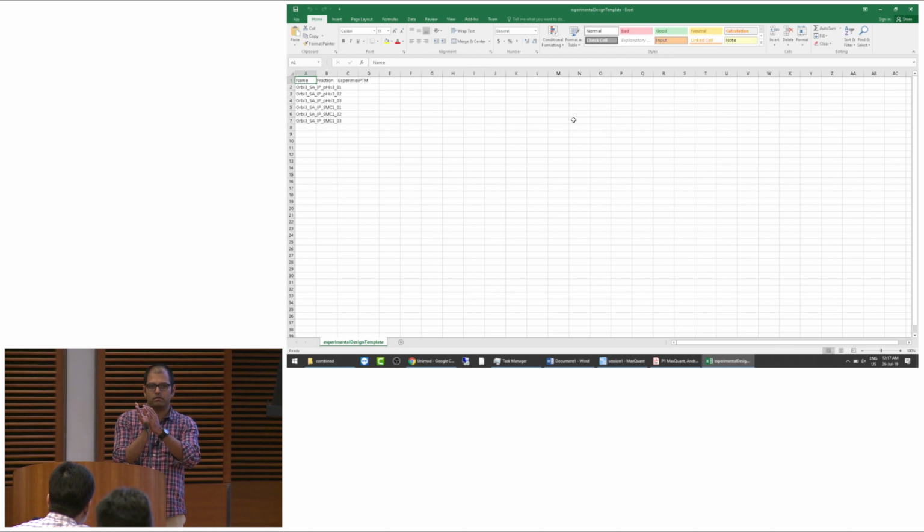Oh. So if you have unique names for the samples plus rep1, rep2, rep3, then it will automatically give unique name plus rep1, unique name plus rep2. So that will automatically do it. So it doesn't even need to know that these are replicates and these are replicates. I mean, because this you will anyways take up in Perseus. Okay, afterwards in Perseus, you can always set the groups. Yeah. I see.